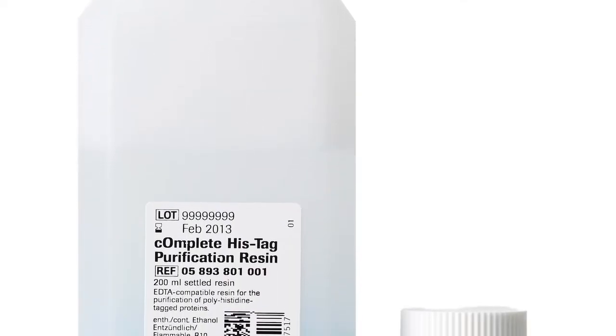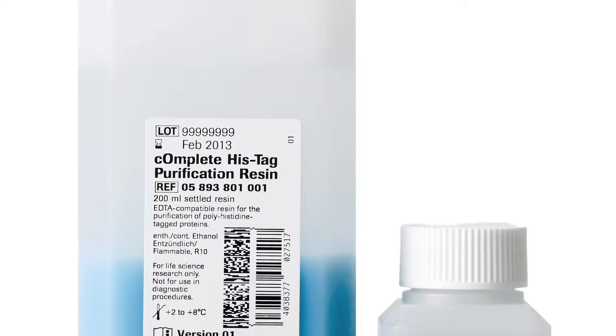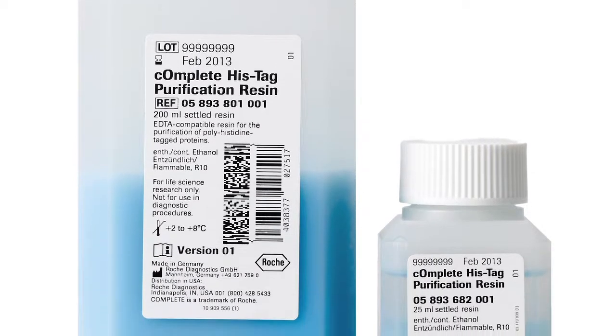Let's talk about form factor — what's available now and what's in the works? We have it available as a slurry right now so that you can use it in batch processing or pack your own columns. Soon, we will be coming out with some pre-packed columns for convenience and ease of use.